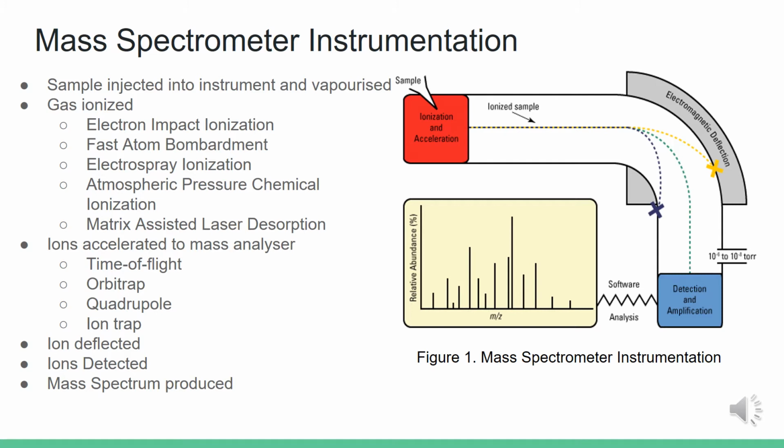The ions that are successfully deflected by the mass analyzers hit the detector. The detector records the mass to charge ratio of each ion and the amount of ions that it detects. From this signal, the instrument generates a plot of relative abundance against the mass to charge ratio of each ion, which is known as a mass spectrum. This process is performed under a high vacuum to remove contaminating samples which can react or collide with sample ions, altering their path.